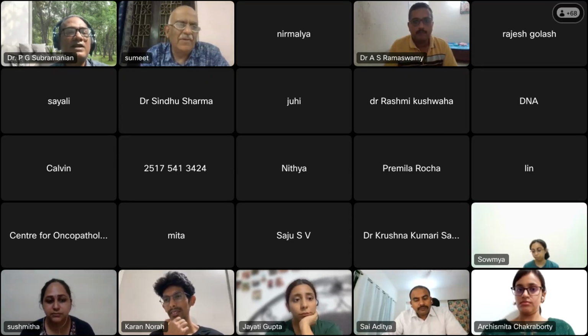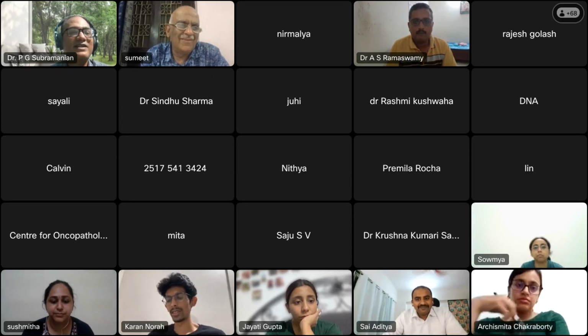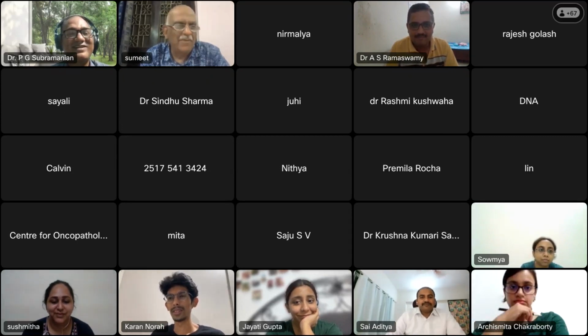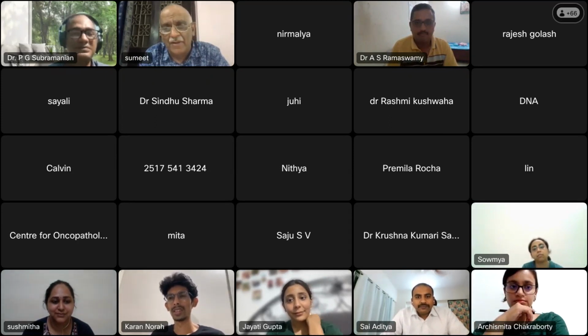But Nirmalya will tell you that we give them more sensitivity than they really require. Nirmalya, is it? Nirmalya is, maybe again, muted. But I think I agree with Mani. If you have somebody like Prashant or Sitaram in your lab, they will pick up 1 cell in a million. So 5% cells.